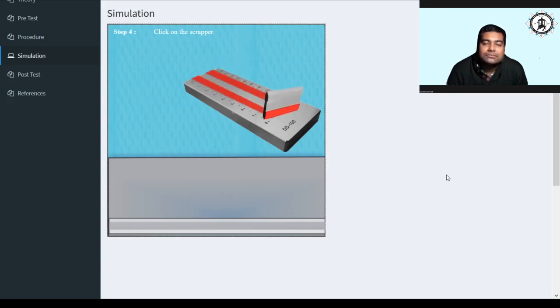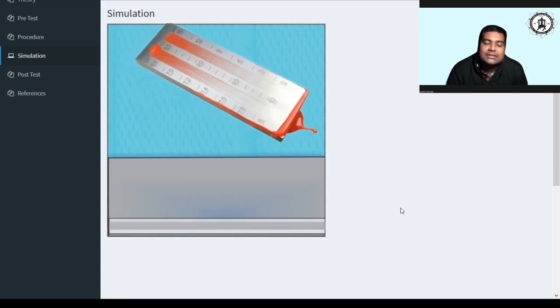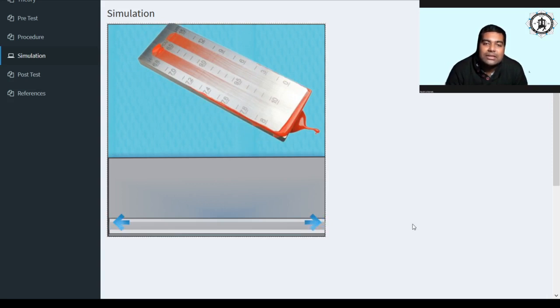Let us see the result. See what is the result. Let us take a look. If you take a look at the result, you will notice one thing. These type of patterns can be found. What happens, as I already told you, why are these lines, not straight lines, these patterns coming? Because there are pigment agglomerates or pigment particles of the size, maybe 9 or 10 microns, right? From here actually it is coming, right?